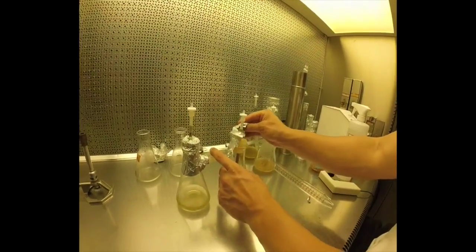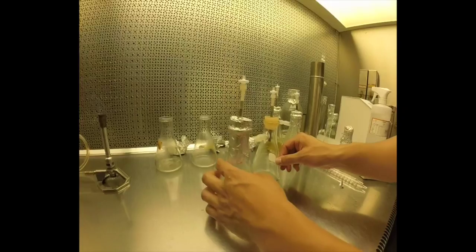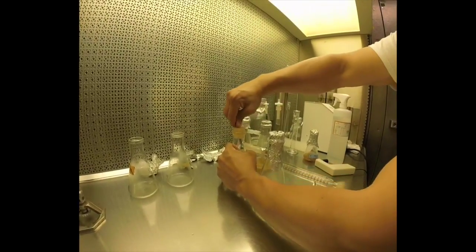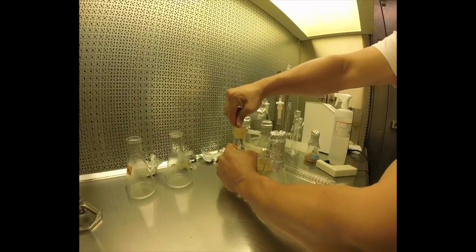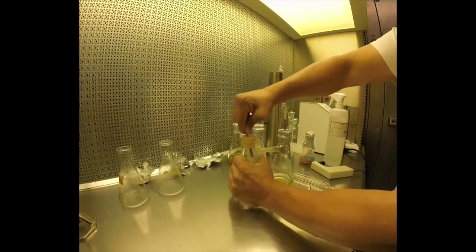So the roots, again, we grow that in B5 medium, which has sucrose in it. And so the roots will consume the sucrose and oxygen and release CO2, which will then diffuse over and feed the Botryococcus, which is growing photolithotrophically, which will then consume the CO2, give off oxygen, which will go back to the roots.